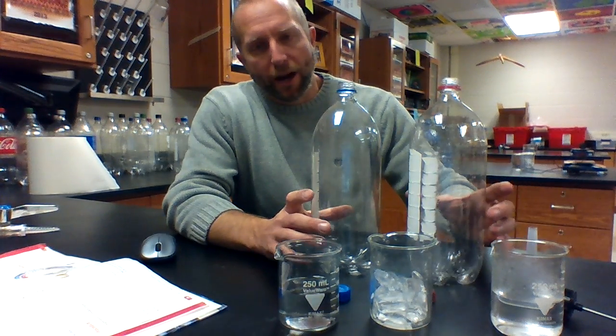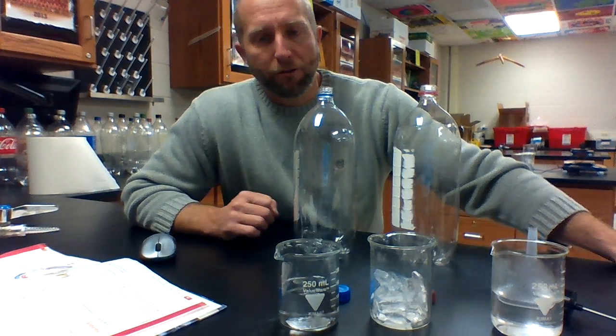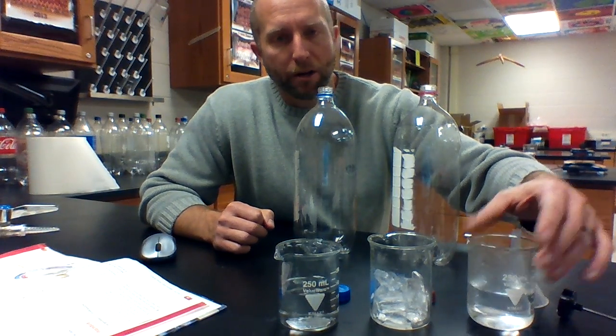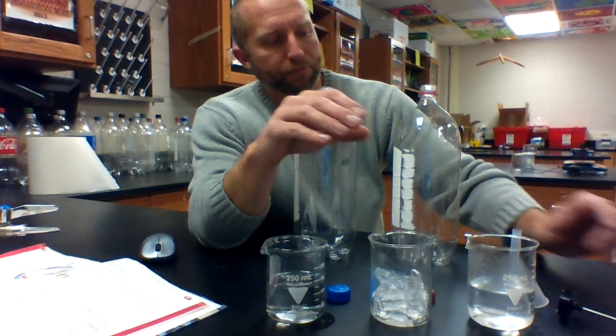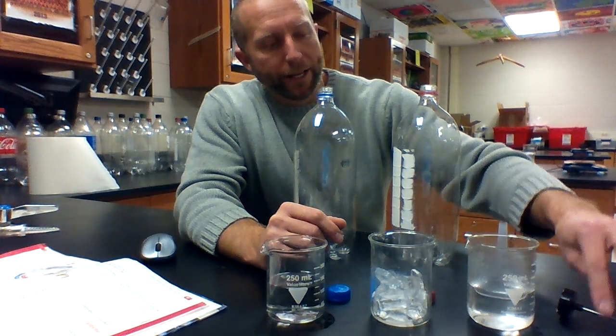The supplies that you have for this lab are a couple of 2-liter bottles. You have a beaker of hot water and a beaker of cool water. You also have some ice. You have a funnel, and you have a digital thermometer.